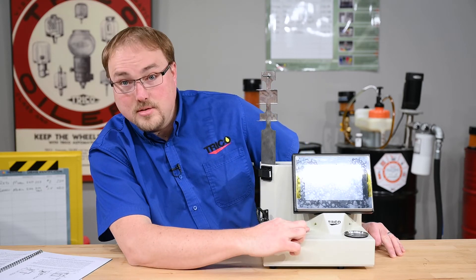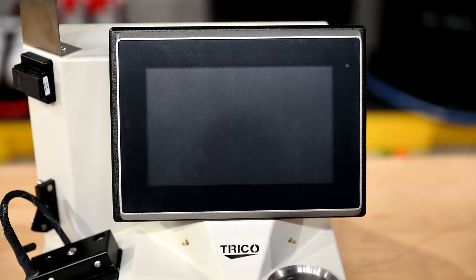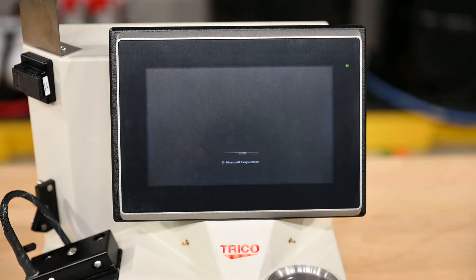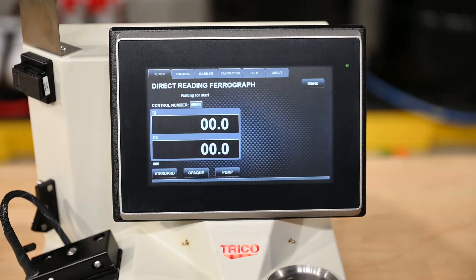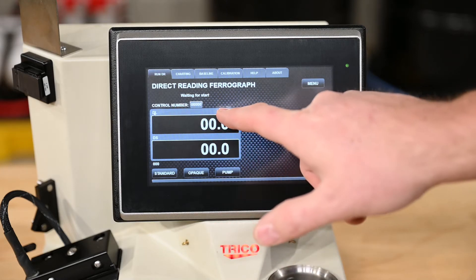Additionally there's the left bulkhead and the right bulkhead. When we turn the unit on, you'll notice the red Trico logo will illuminate and then the screen will start up and the Trico DR program will automatically load. Once the unit is fully turned on, you will see the home screen of the DR7 program. You'll note it says 'waiting for oil.'